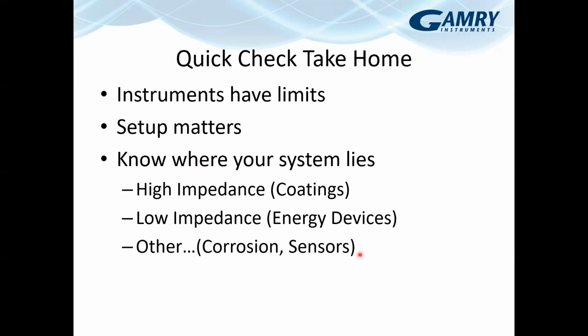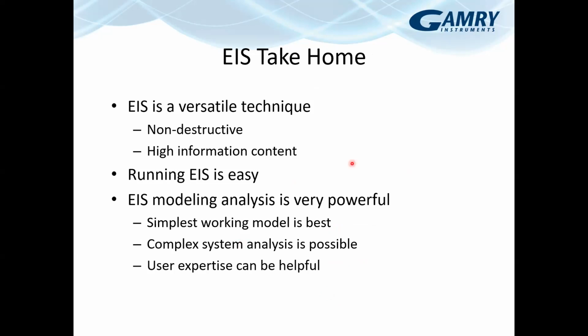Sensors are another one that have a tendency to be all over the place in terms of the impedance. They tend to be more higher than lower, and a lot of times sensors are looking at changes in the capacitance of a system. So that's the take home for what that is.